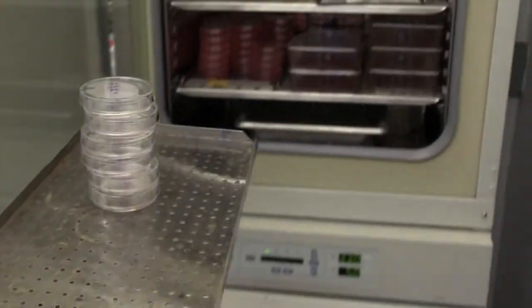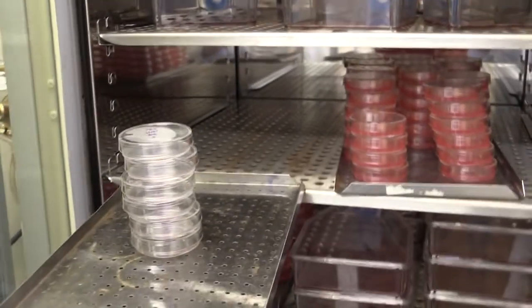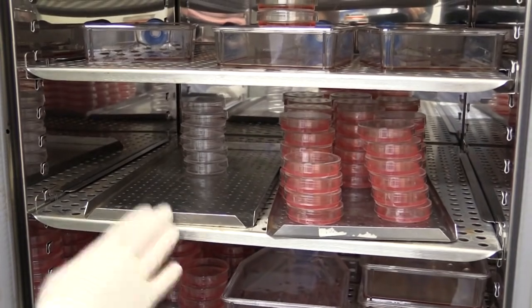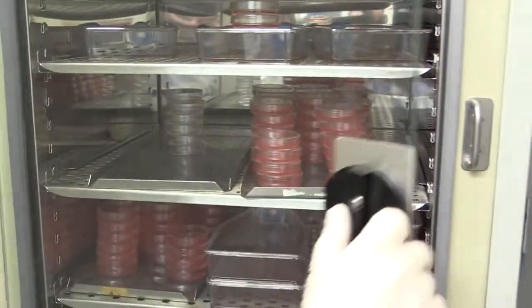We let the virus absorb to the cells at 37 degrees Celsius for 60 minutes, and during this time the virus particles are binding receptors on the cell surface. While this is happening, we prepare the overlay medium.